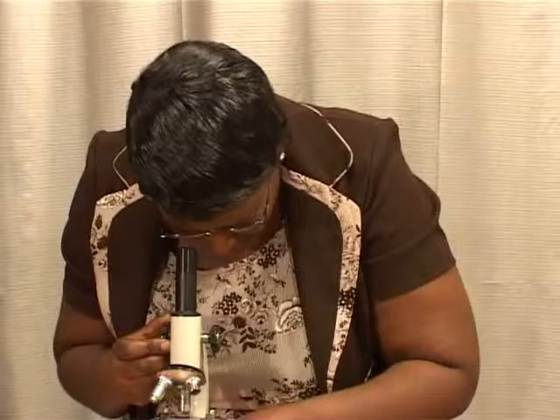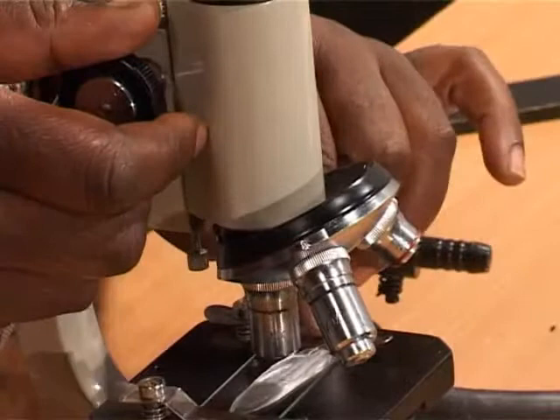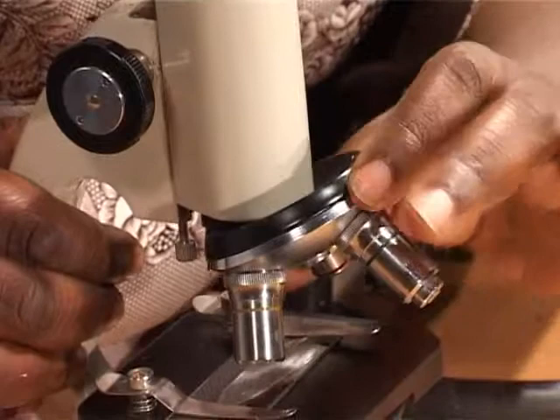Okay? You have to move the lenses, the objective lenses. As we can see, these are called objective lenses because they are near to the object here. So you use the turret to see according to the magnification you want. These objective lenses have what we call magnification, how many times it magnifies.